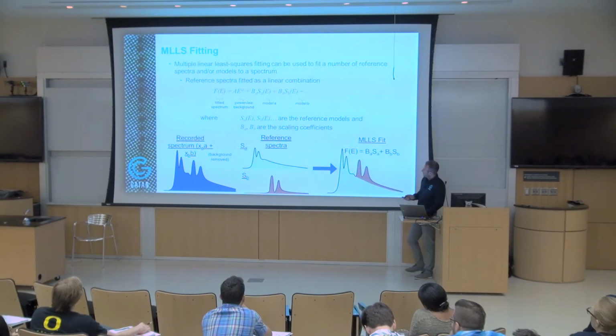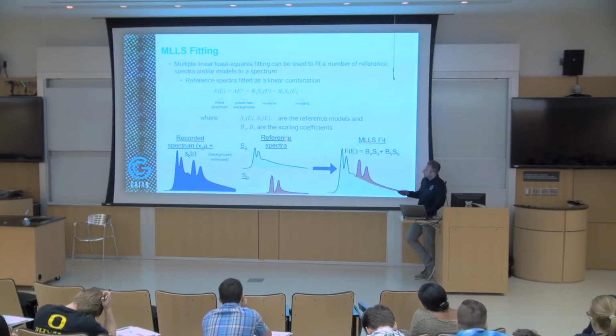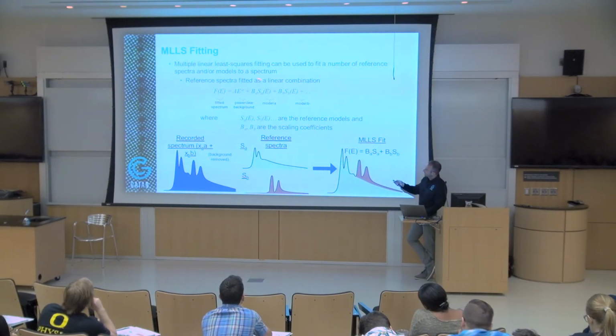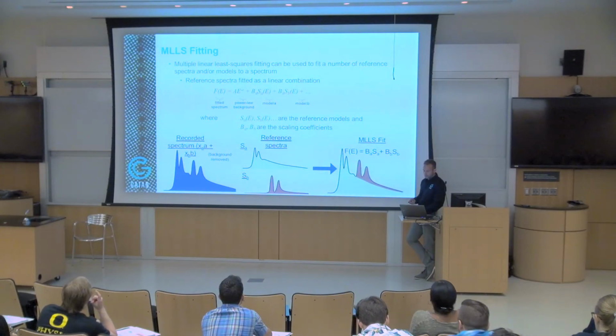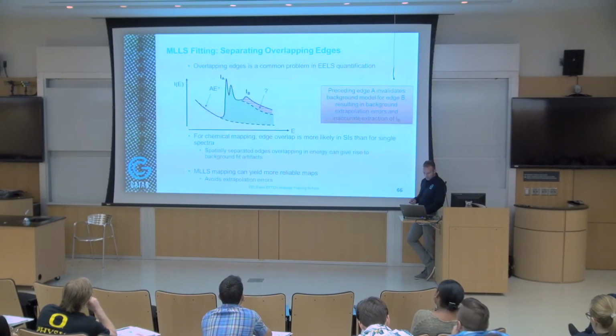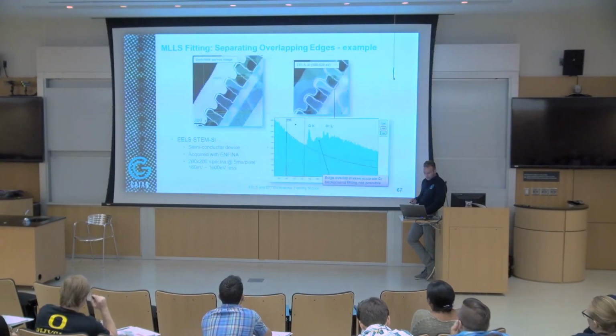In this particular case, you only need to have reference spectra. If you have reference spectra, you feed them in, and the software will automatically work out the scaling coefficient. And from the scaling coefficient, looking at the latest version of the software, we'll be able to work out the quantification, so the composition. Let me just show you one example real fast.